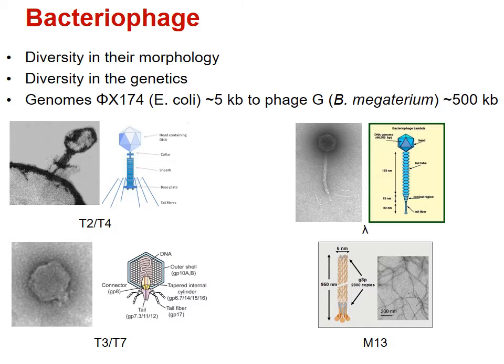Now we're going to work with a few different bacteriophage this week, and here are just a couple of examples. The one that I showed is very similar to the one that's known as the T-even bacteriophage: T2, T4, T6, and a host of other ones. There's lambda, which I think is what's on the actual previous picture. Lambda is a very interesting one. It's been used for lots of studies in gene regulation and many other things, as have bacteriophages T3 and T7, which are very, very similar to each other. They're the ones that most look like lunar landing modules.